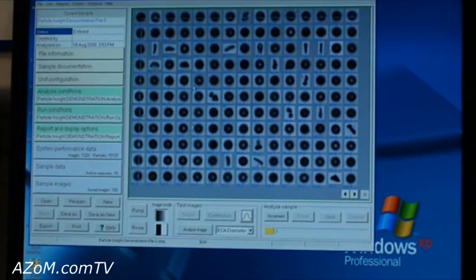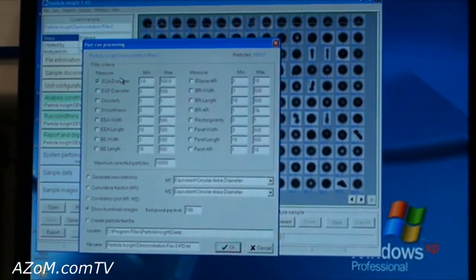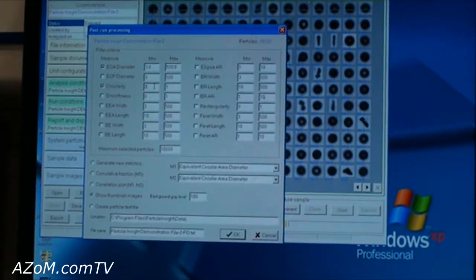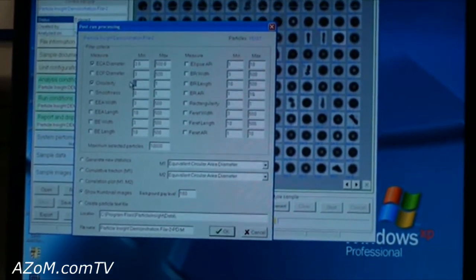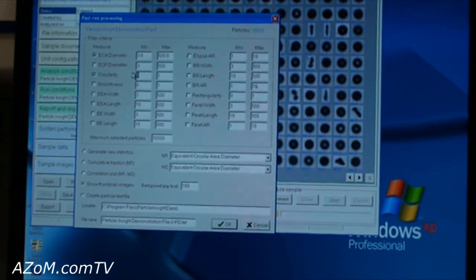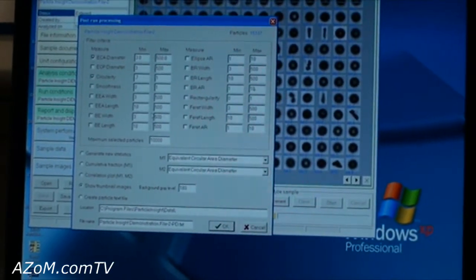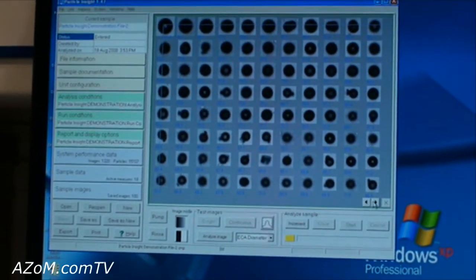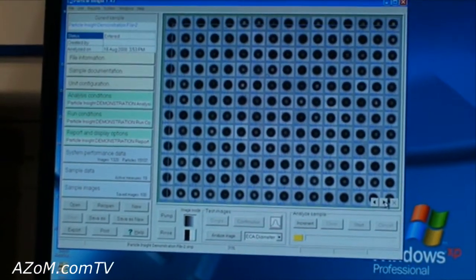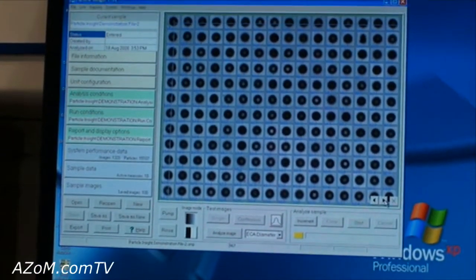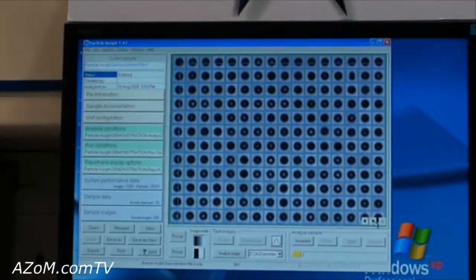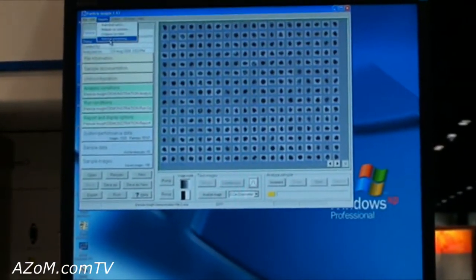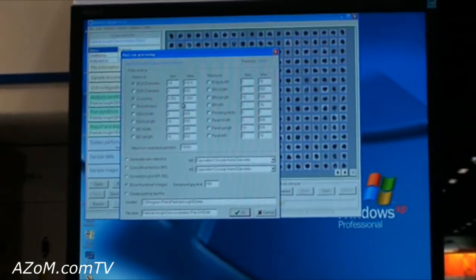For example, if we only wanted to see the particles that were round, we can go in and say just show me the particles that have a circularity pretty close to about one, one being a perfect sphere. And I'll actually sort out only the ones that are spherical. Going the other way, you can say, well, I'm not interested in seeing anything that's a sphere — just show me the things that are not spherical.